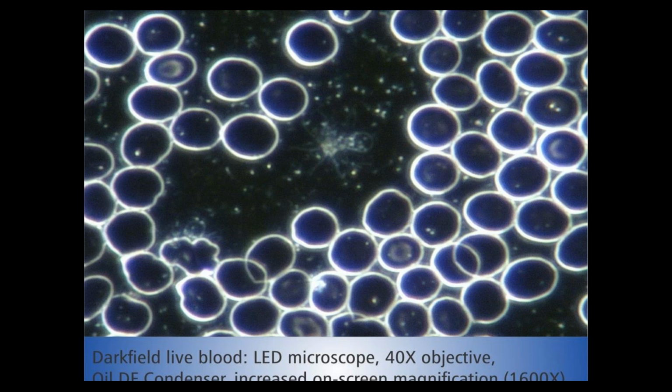Very interesting. The magnification range is also quite important, isn't it? Live blood analysis requires a different setup with regards to the magnification to camera. Could you explain what is required here? Yes, absolutely. This is actually a very important feature, and one that will again play a very big role in one's ability to observe all the anomalies in the blood.